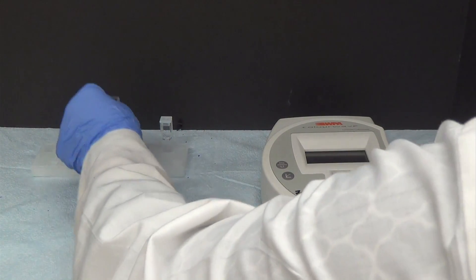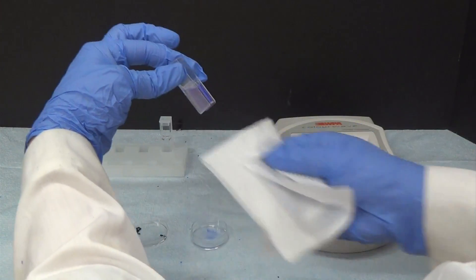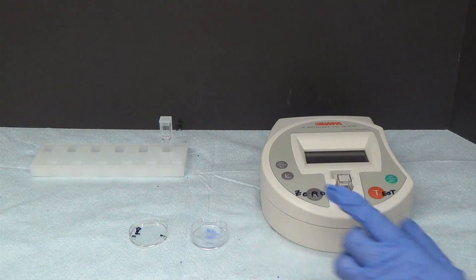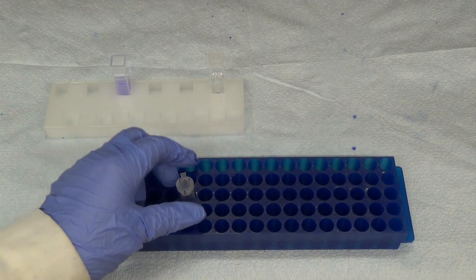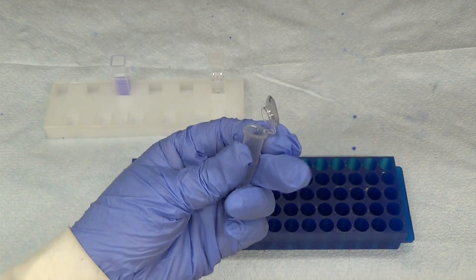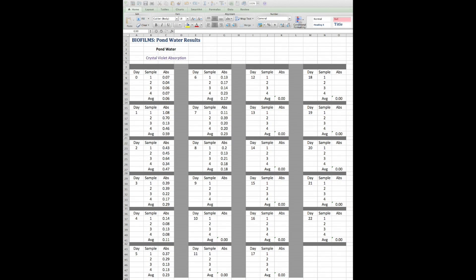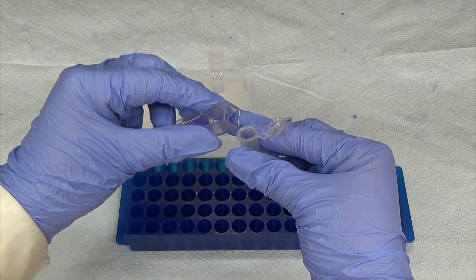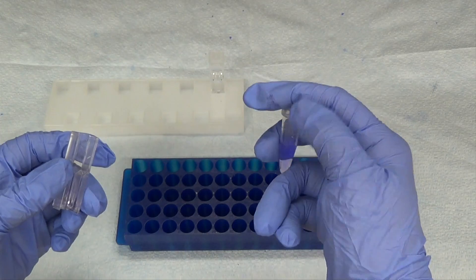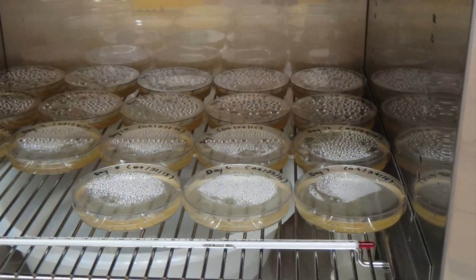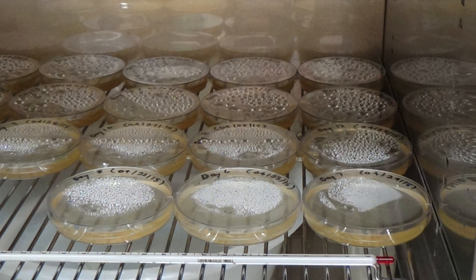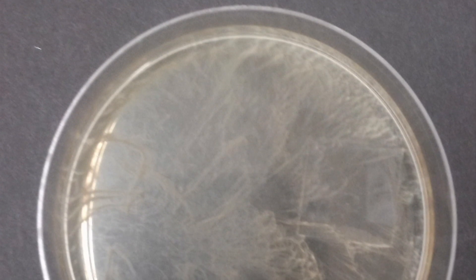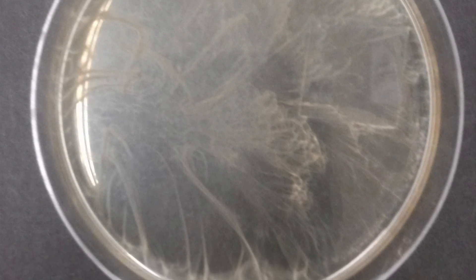Once 15 minutes have passed, pipette 1ml of each sample into its own cuvette and measure the absorption on a spectrophotometer set to 590nm. Alternatively, you can store samples in a labeled Eppendorf tube and measure absorbance later. Record the findings of each day in either a lab notebook or an Excel spreadsheet, and store samples in labeled Eppendorf tubes. Repeat this protocol over a course of time set up in your experimental design. Once all of the data have been collected, each day's growth and amount of biofilm formation can be determined.